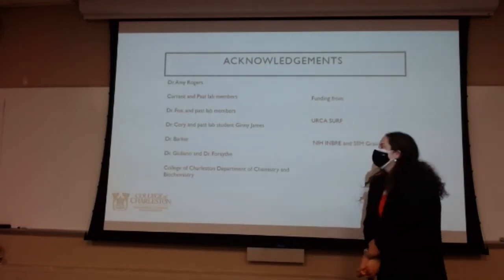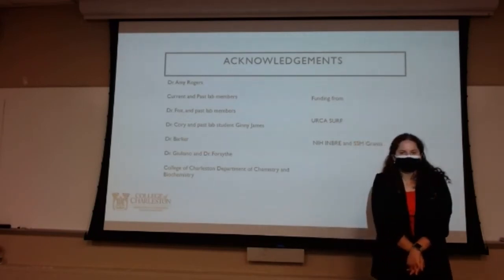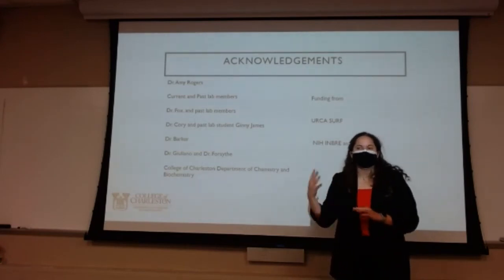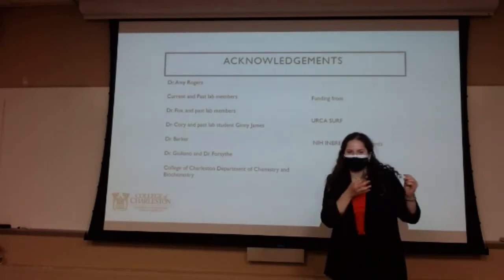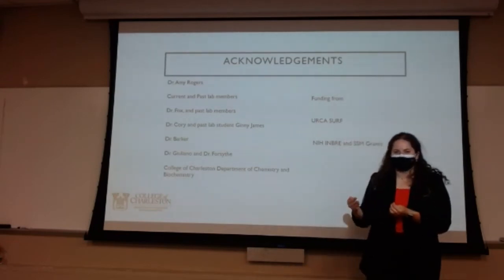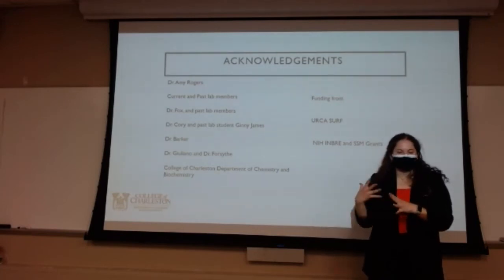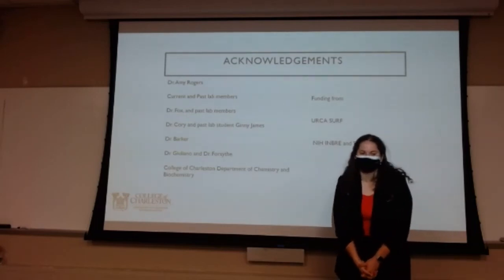Okay, so in terms of other applications, in terms of the HPLC amino acid assay, if we get good standard times for these amino acids, it could be applied for other people's other conditions or other experiments where they might need to look at intermediates of amino acids. In terms of E. coli, we use E. coli to grow the protein in the first place through the use of a plasmid. I wouldn't necessarily say we look at E. coli as much, but that is the best I can answer that question. If that's helpful.